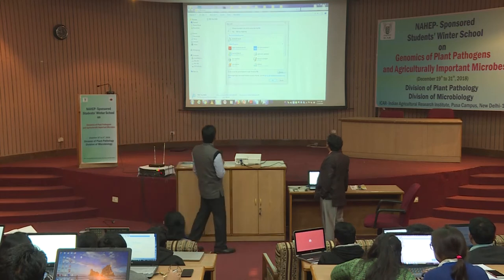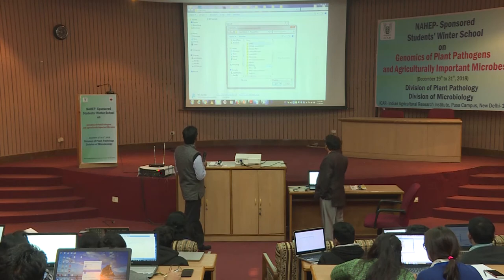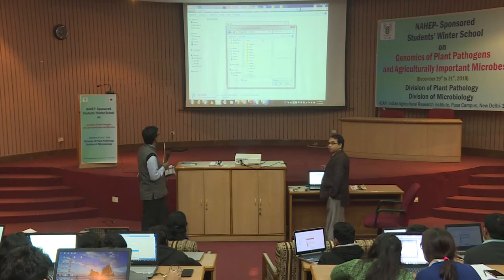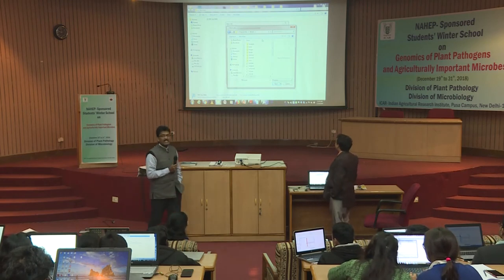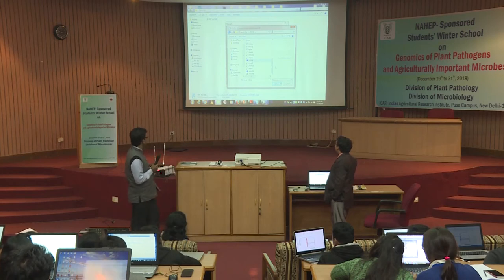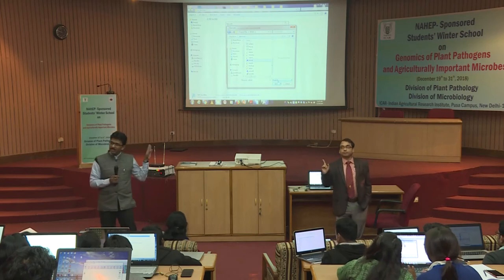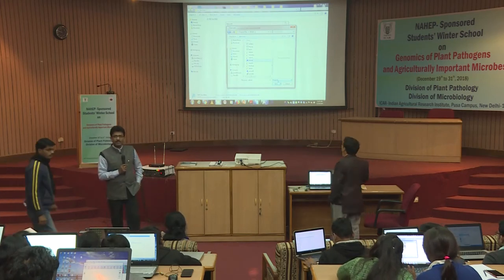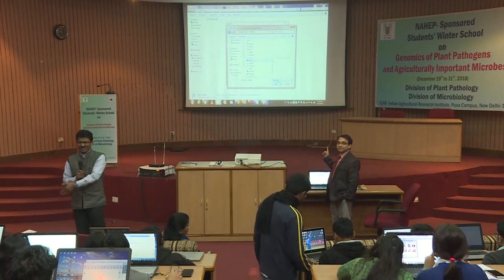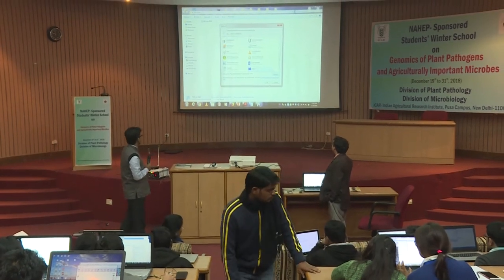Mega must be there. Mega is there. If you are not able to find it, go to the program files and open it from there. Just type MEGA. Mega 6. You have come up to this. Even if you have the latest version, it doesn't matter, it will work. Everybody come up to this. So open it through Mega. Say okay.